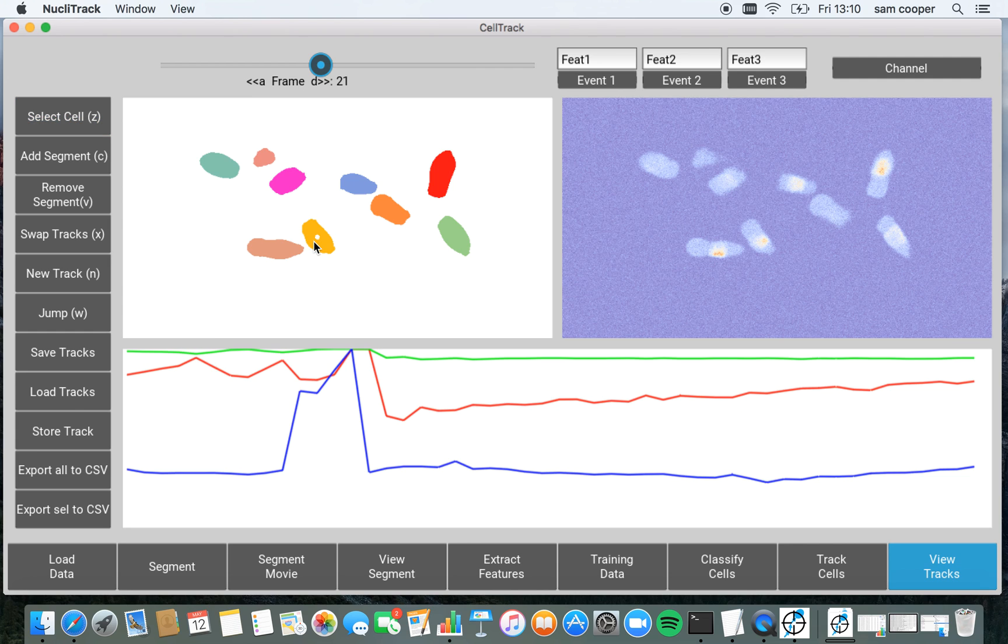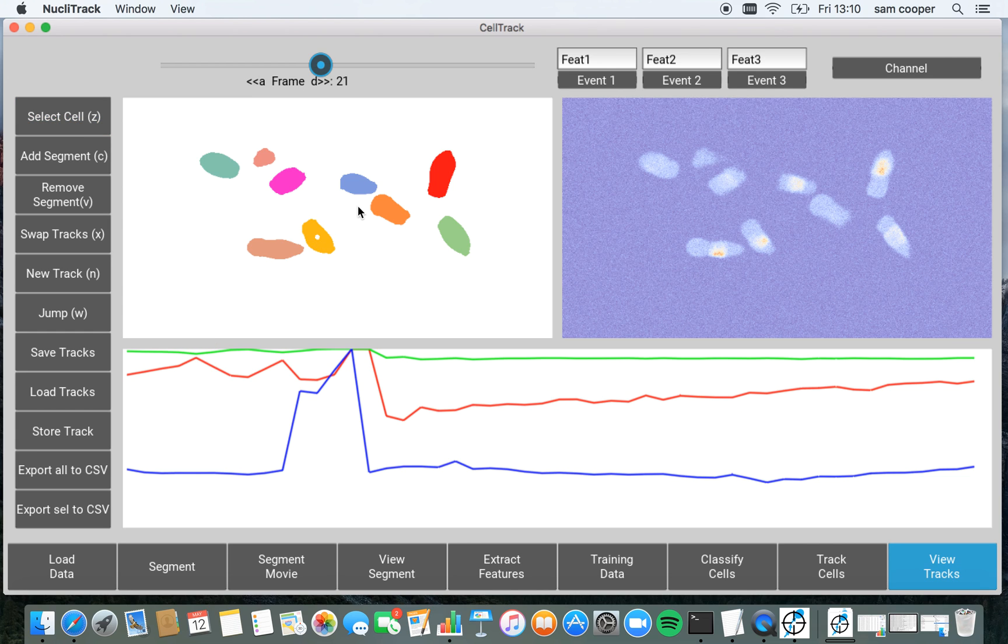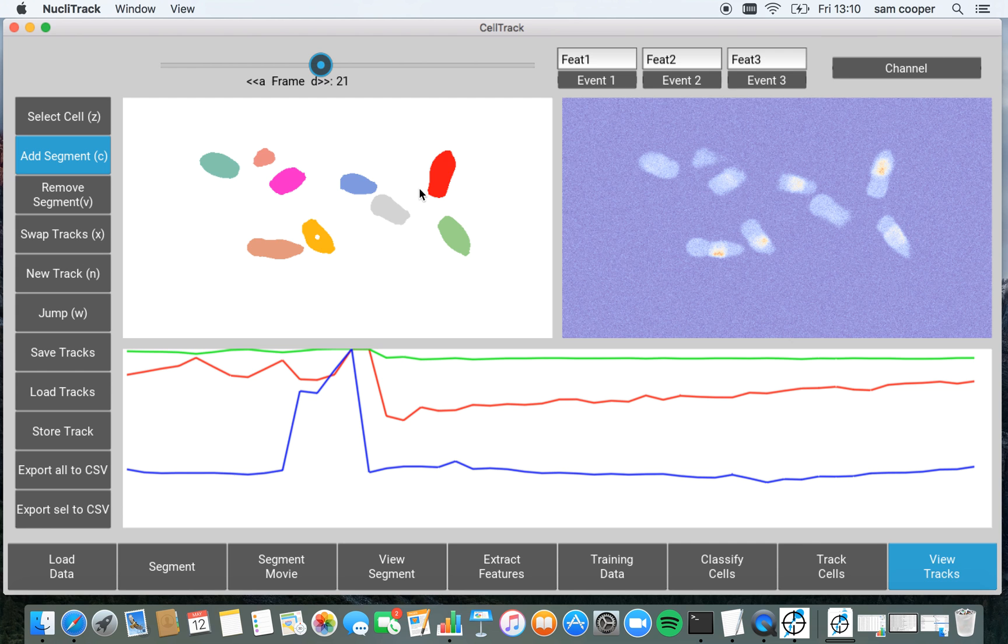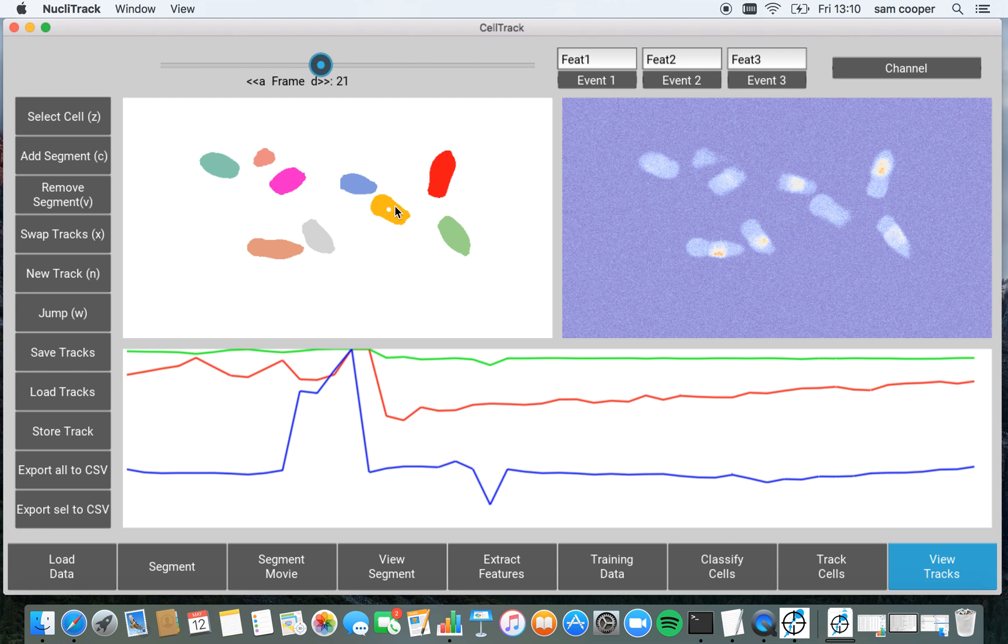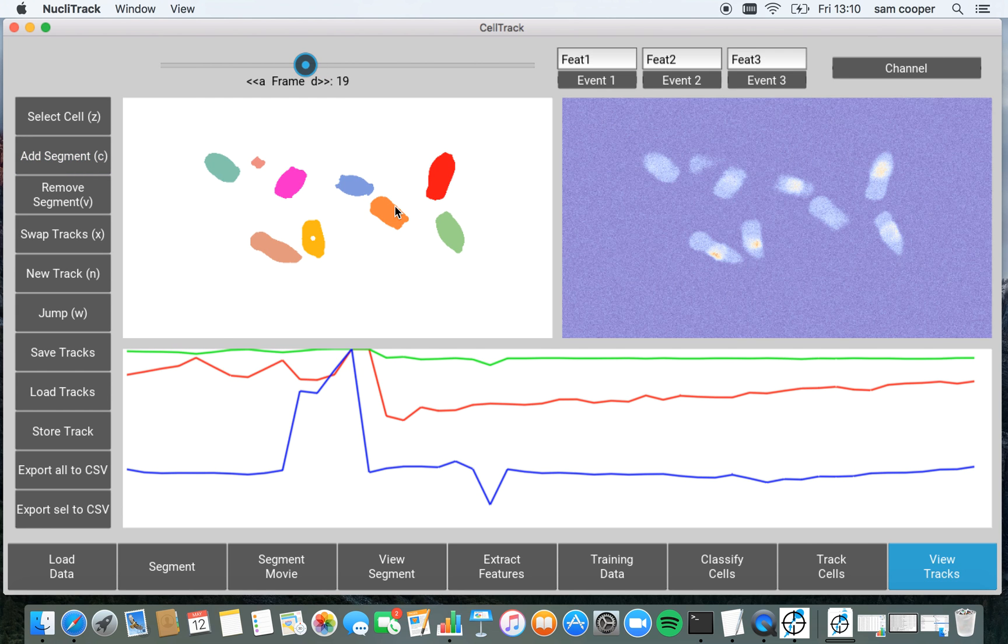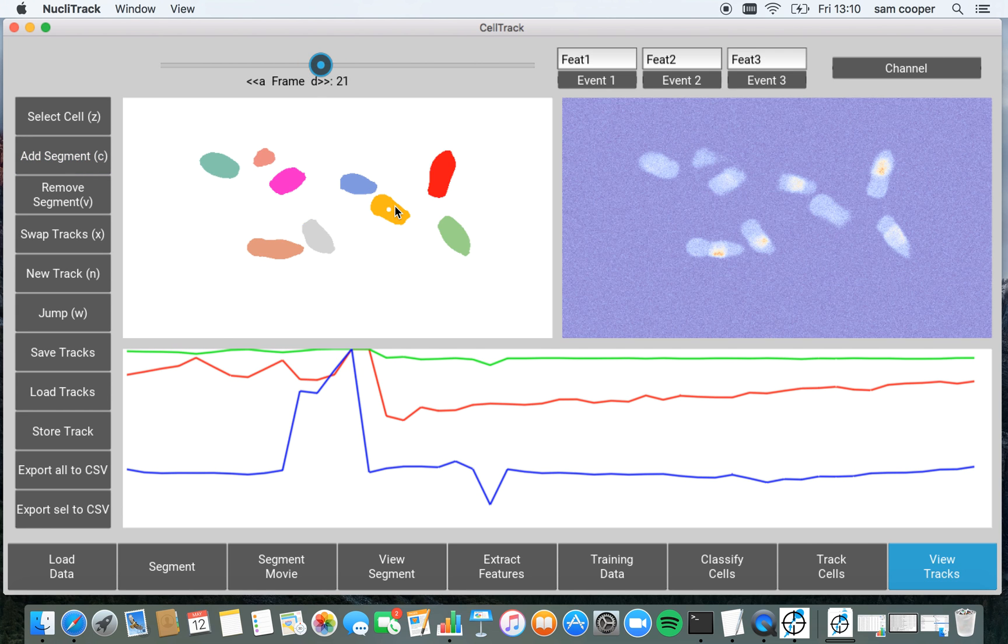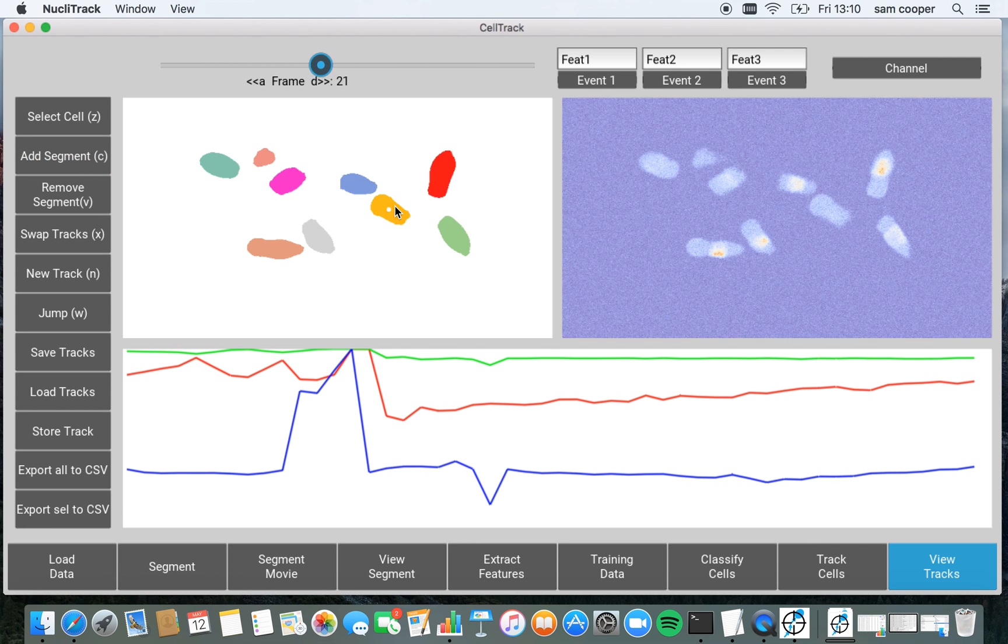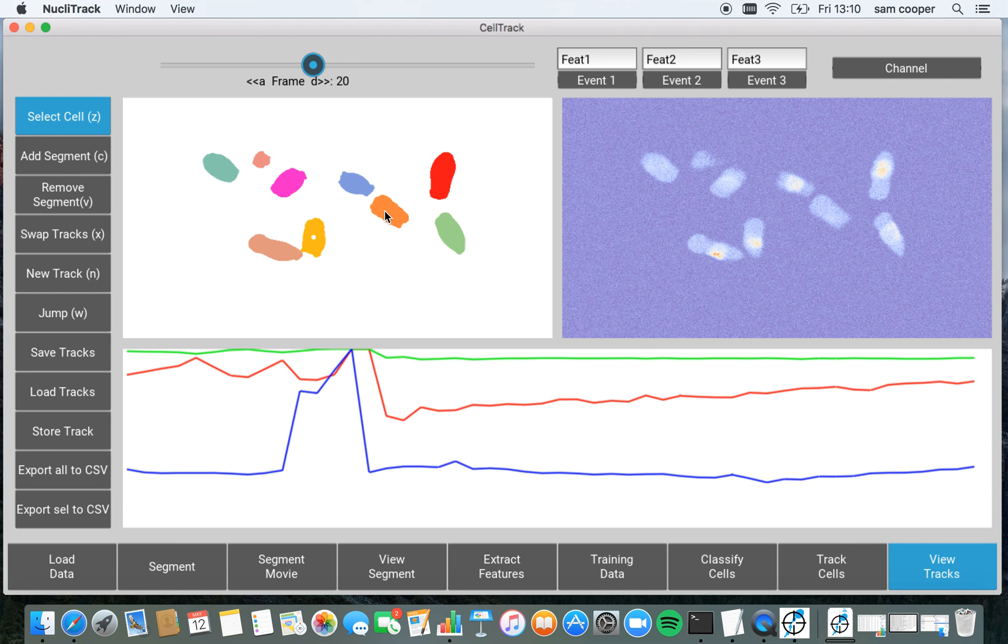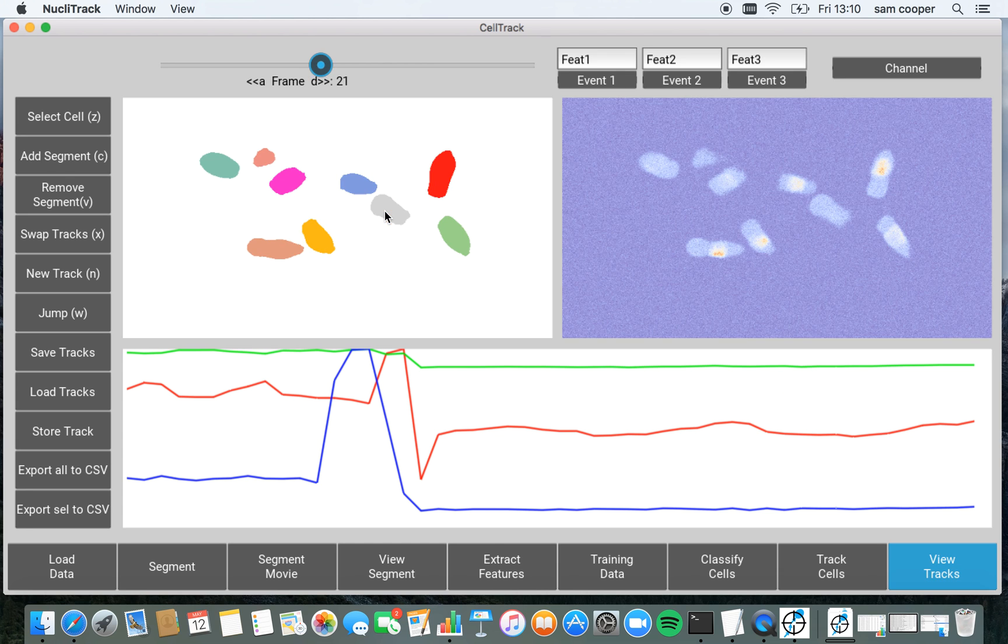I can also delete segments from NucleoTrack using the button by pressing V on the keyboard or selecting remove segment. And then reassign a single segment to this, or a single track to this segment. So you can now see that this jumps over to that cell for one frame and back again. I'm just going to re-correct this again by adding the segment back to this, selecting this track, and again assigning the segment here.